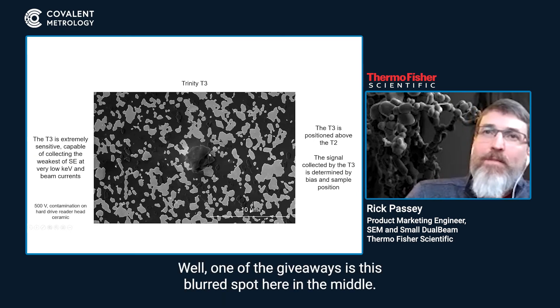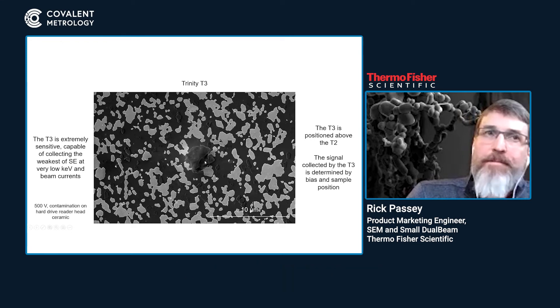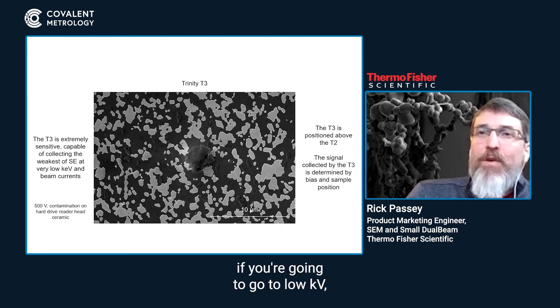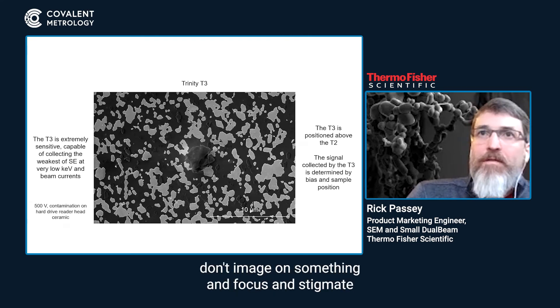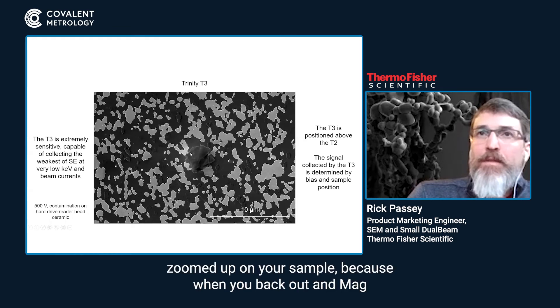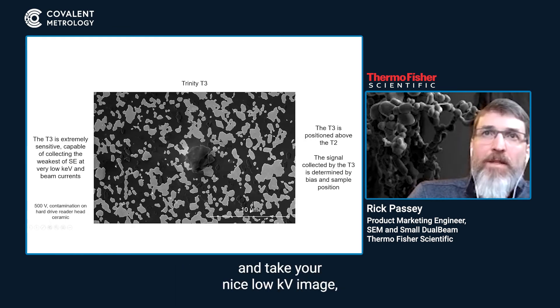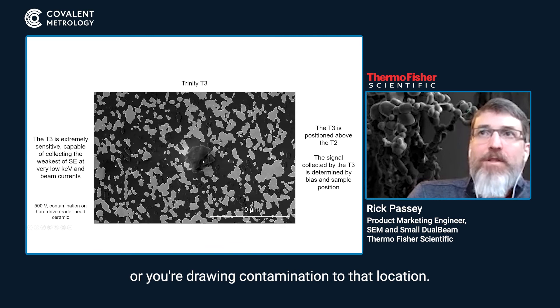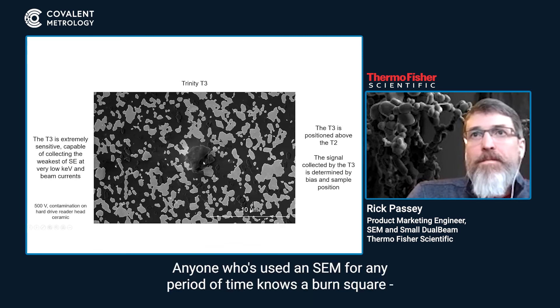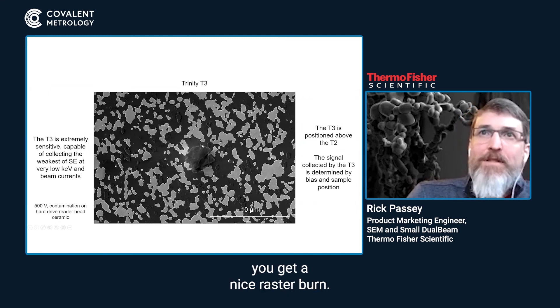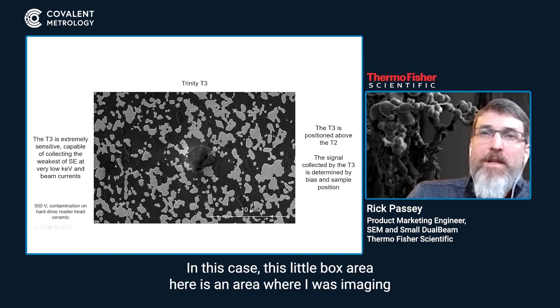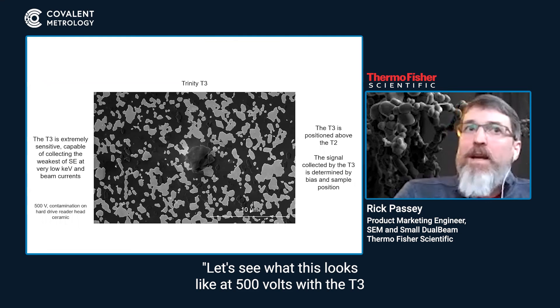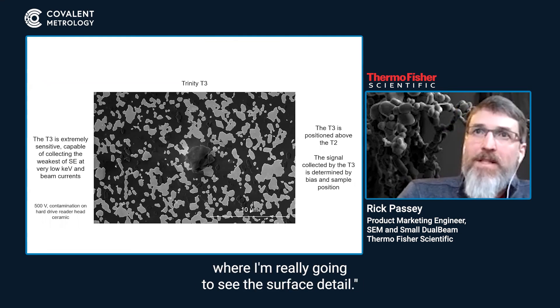How do I know this is the surface? One of the giveaways is this blurred spot here in the middle. Unfortunately, one of the things you have to think about when trying all these different settings is: if you're going to go to low KV, don't image on something and focus and stigmate zoomed up on your sample, because when you back out in mag and take your nice low KV image, you're going to see the beam damage you've created — whether it's charge buildup or contamination drawn to that location. Anyone who's used an SEM for any period of time knows what a burn square is. You get a nice raster burn, and in this case this little box area here is where I was imaging at higher KV, not thinking about what it would look like at 500 volts with the T3 where I'm really going to see the surface detail.